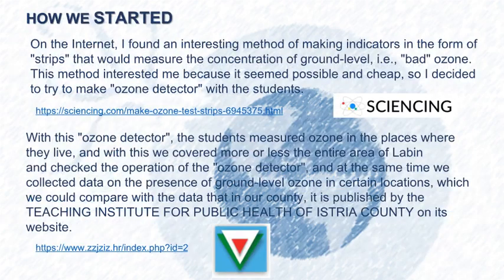On the internet, I found an interesting method of making indicators in the form of strips, so I decided to try to make an ozone detector with the students. With this ozone detector, the students measured ozone in the places where they live, and with this we covered the area of Labin. Results we could compare with the official data of the Teaching Institute for Public Health of Istria County.